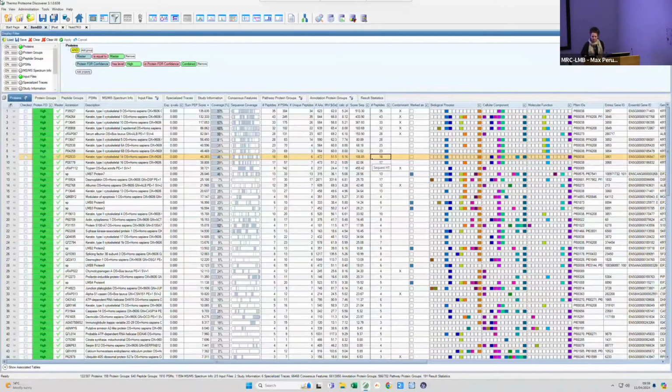Okay. So let's start with the gel band analysis. Right. So when we send you an email with the results, you usually have a link to download your results, correct? And in this link, you'll have different data. You'll have an Excel spreadsheet, which we usually provide for you to look at your data in Excel. And this is usually filtered information. So we already applied the general filters, which I'm going to show you what they are. And you can just look at it in your PC or in your Mac. So absolutely up to you where you look at the Excel spreadsheet.